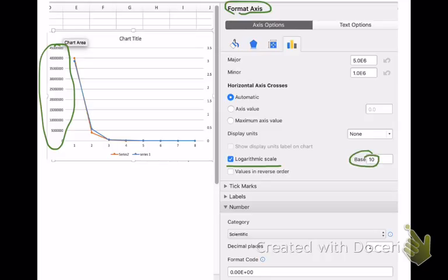And when you click on that, you'll be able to make changes to this particular axis. Here's the format axis screen. And we're working with this vertical, the primary vertical axis. And what we want to select, it's already selected here, is logarithmic scale. The default will be base 10. And if you look down a little bit farther, you'll see that you can also change the number, the way the numbers are going to be displayed. And in this case, we want scientific numbers. And the format for that is shown down here. Zero, E, and we'll have a number following that E. And the E stands for exponent in this case.